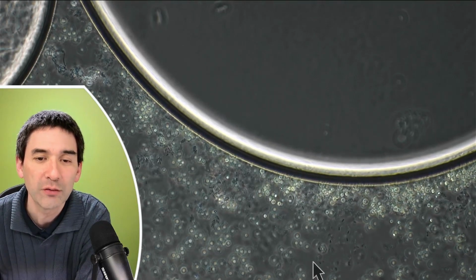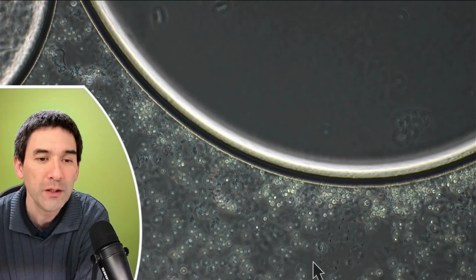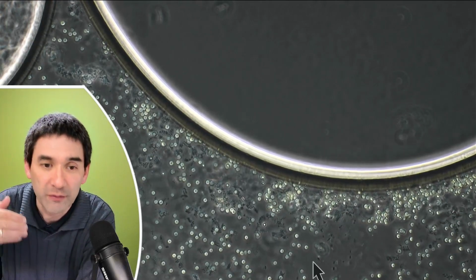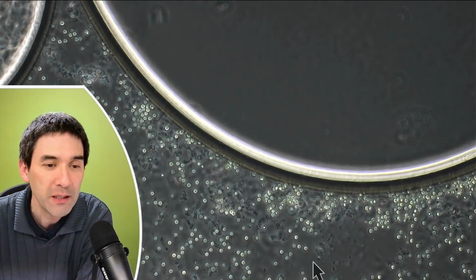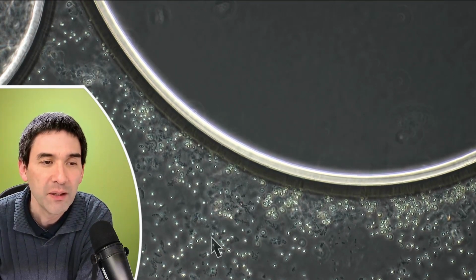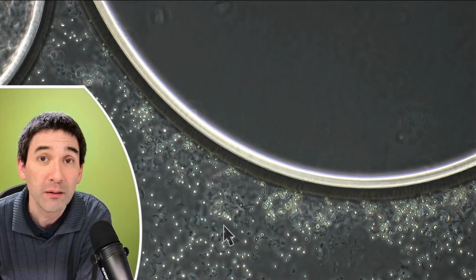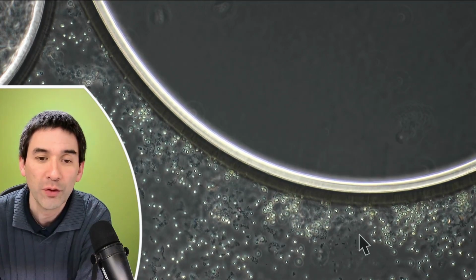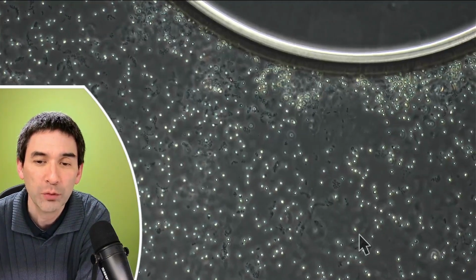So that's clearly directional motion, but many are because they have a flagellum, or cilia, that move and kind of move them forward. But you see that many of the other cells are moving and vibrating randomly, and this is essentially Brownian motion, and it's non-directional. When the cells move on their own, then this is of course a directional movement.